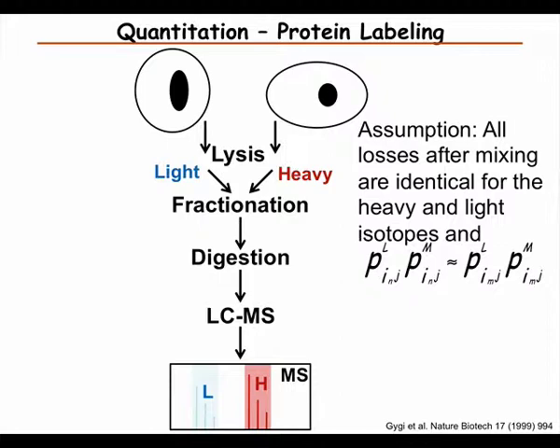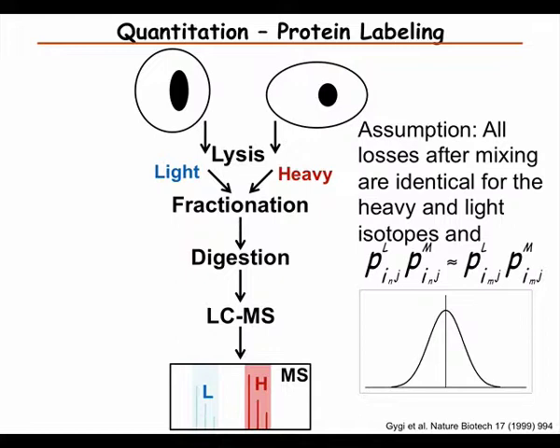Anything before we mix them together, we have to be really careful that there is not a lot of variation. You can do it on the protein level, and in this case it's symmetrical, since in both cases we compare two samples that we label heavy and light. So we shouldn't have too much systematic error because of the symmetry.